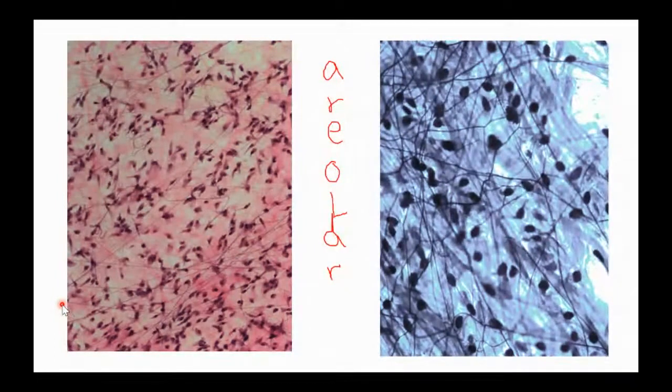Fibroblasts are fiber builder cells. They build proteins. So when I'm looking at areolar connective tissue, you're going to see cells that are spaced out with lots of little proteins around them. See how I've got this protein right here that's curled up on itself, or this one right here, it's a little curled up on itself. Those proteins are elastic proteins, so they make it really squishy.